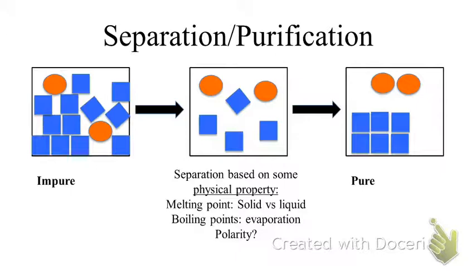So what else could we do to break all of those forces? Filtering would work in only certain circumstances. Filtering is not going to break the intermolecular forces, though. I have to break every single one of those interactions that's holding it together as a solid. If it's a solid, I can't filter. You don't filter solids away from solids.